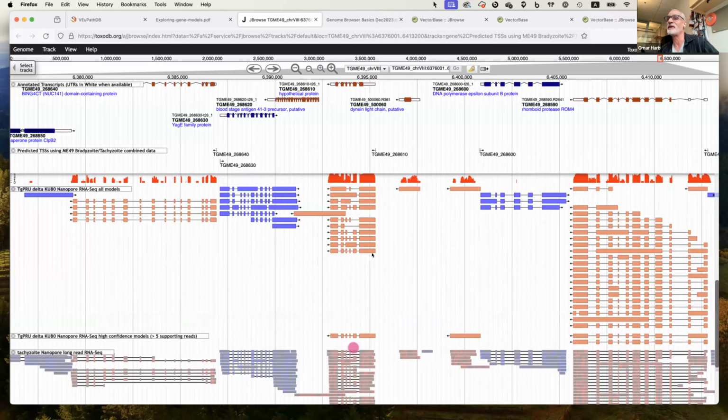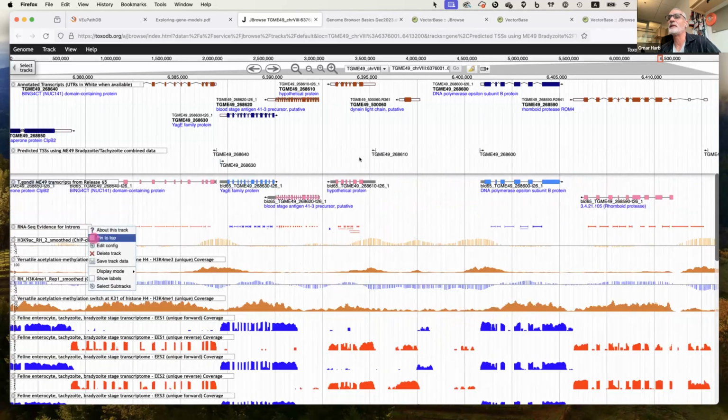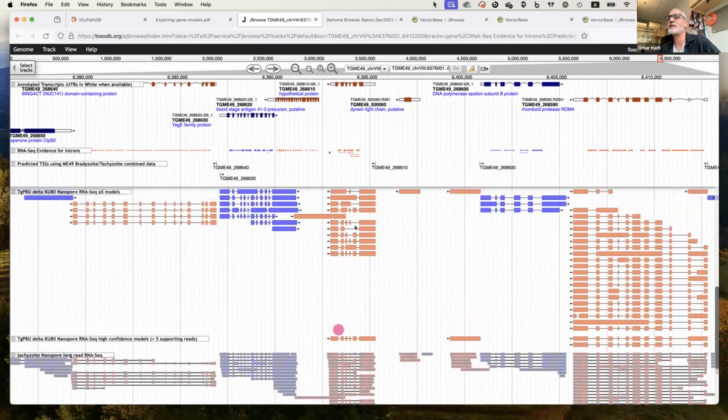And it would be interesting to see if some of these match these intron spanning reads, the ones that are a little bit lower in abundance. And so if we look here, you may be curious to see, well, do I have ones that match these exon skip polymorphisms? And it's possible that some of these exist there, but they're very low in abundance.